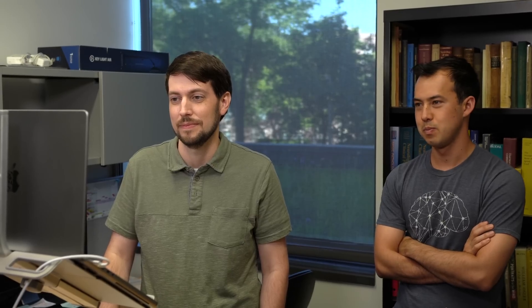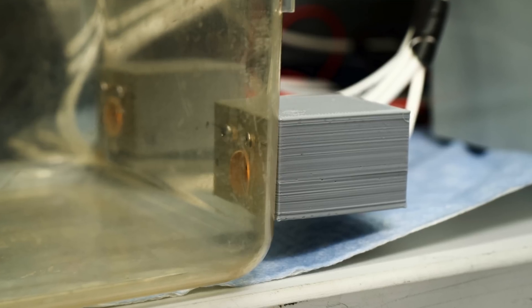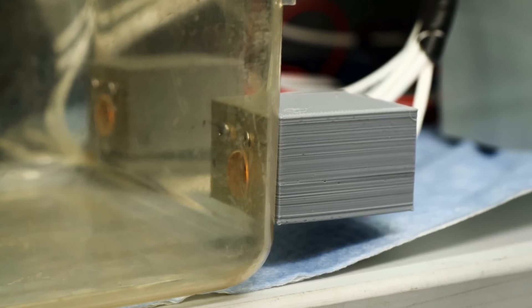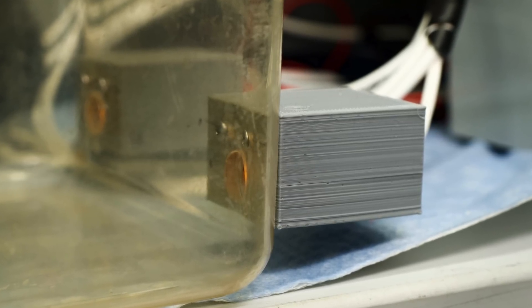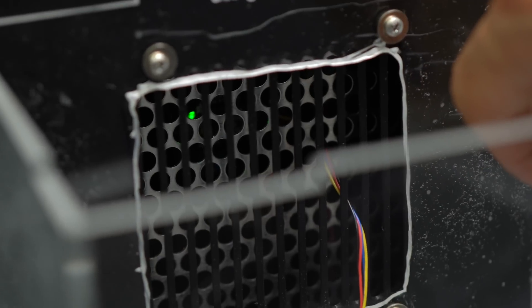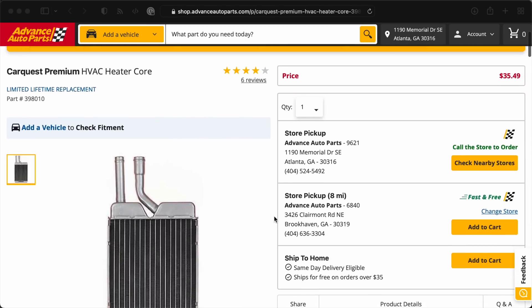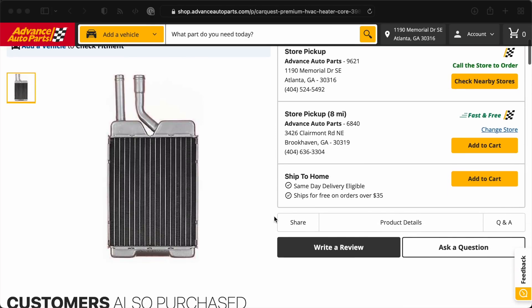So the gray plastic that's used on the nose poke is called ASA. It's a better kind of plastic, more difficult to print, doesn't melt quite so fast. And the heat exchanger, I had several ideas for heat exchanger, but Phelan wants this rapid drop in temperature. The first iteration had 15 minutes time to drop and that wasn't good enough. So that heat exchanger is a $30 to $32 heater core from Advanced Auto Parts.